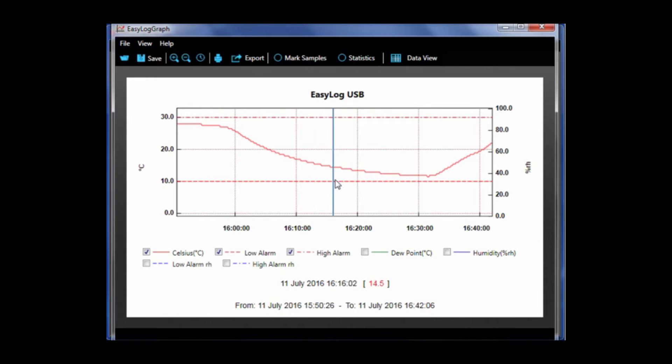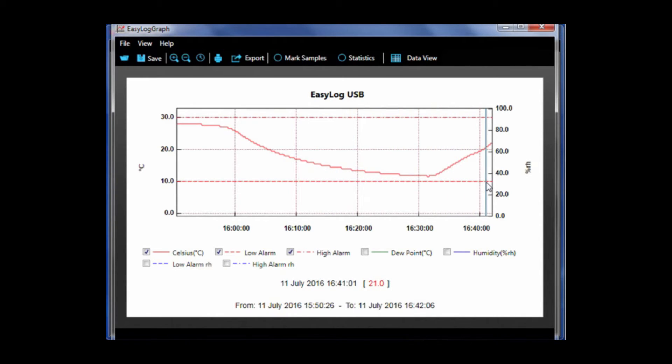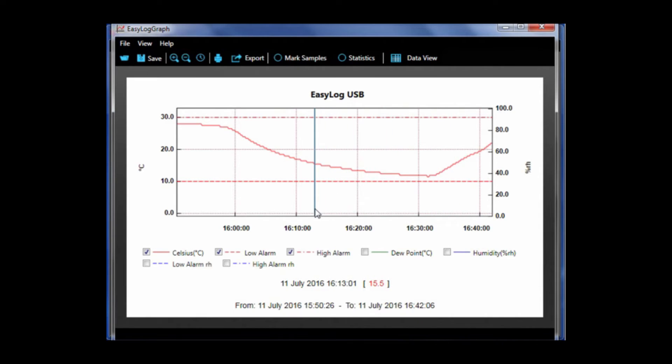The horizontal dotted lines running across the graph indicate the set high and low alarm points so you can easily see if an alarm condition has been met during the course of the recording.